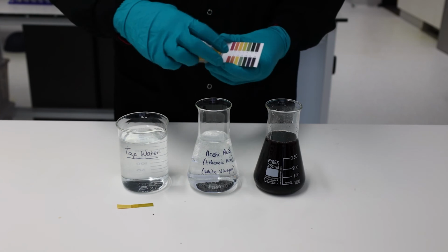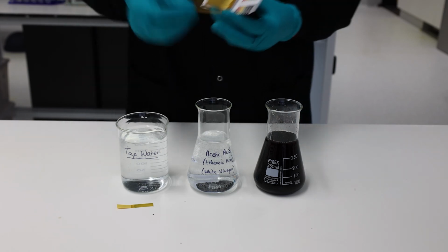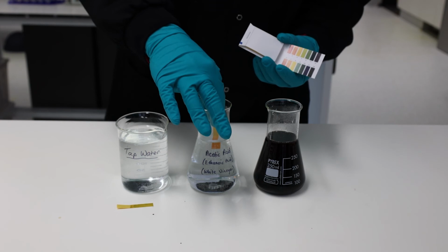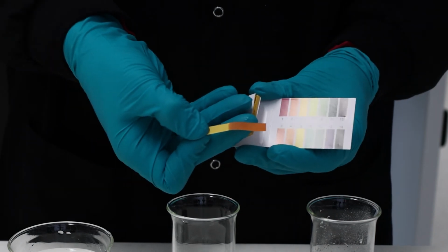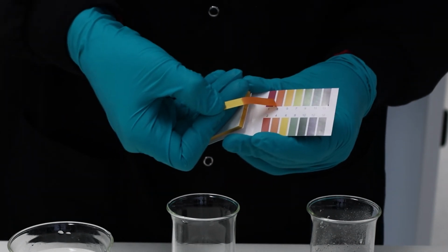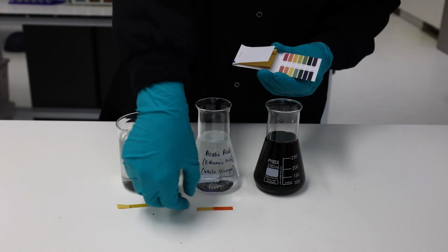So let's try another one. Let's try vinegar. So vinegar is an acidic material, an acidic solution, and so we should get a more acidic colour develop. Oh, here we go. So we're getting a much more reddy orange colour. And so if we compare it to the chart, we're getting a pH of about 3, maybe 2.5. So much more acidic than the tap water.